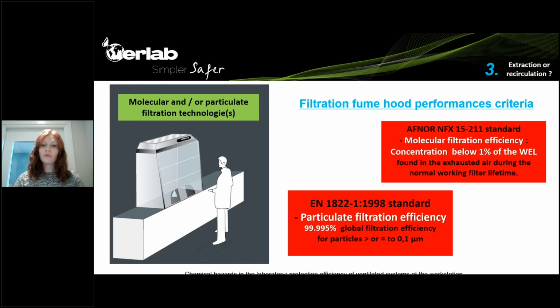First, the molecular filtration efficiency is verified through the AFNOR NFX 15211 standard, which states that the concentration should always be below 1% of the workplace exposure limit value found in the exhausted air during the normal working filter lifespan.